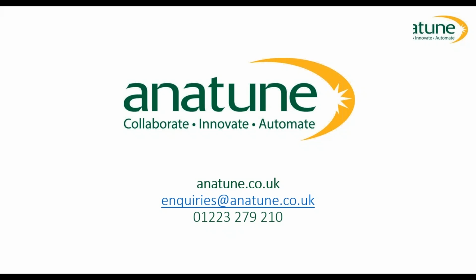It depends what you're looking to do. It all comes back to, I suppose, what is the data you're looking to generate? So it's generating meaningful data. There may be situations where you might be looking at running standards that have some stability attached to them. So you're generating standards for your linearity plot, or for your inherent calibration approach to your system, that you may not want to prep up every time you run the system.